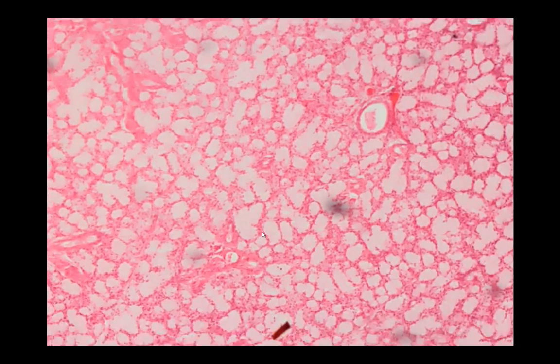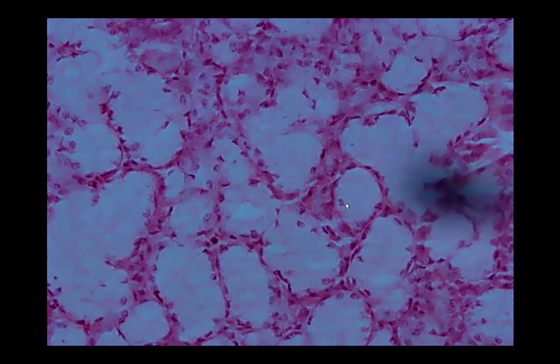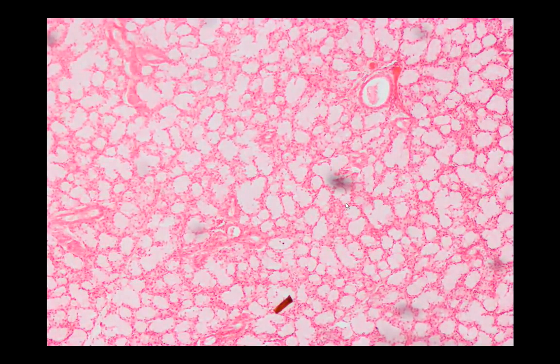So if we're going to look at the cells, at the acinar structures, mainly it's composed of mucus acinar cells. Okay? This one is a Serous Demilune. Okay? You would see a cap of serous acinar cells, and this would be the mucus acini. So take note that in both sublingual and submaxillary or submandibular, Serous Demilunes can be appreciated.